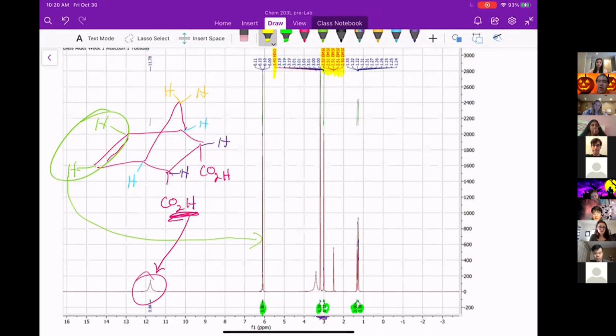Now, sometimes when you've got all these peaks, it's hard to tell which one. If you look, there's actually a little red mark above these. Those are the ones that the instrument has marked as solvent. It's easier to see it that way, because from the top down, it gets a little hard to make the connection sometimes. So if it's got a red tick above it, the instrument thinks that it is solvent. It's usually right. Not always, but it's usually right.